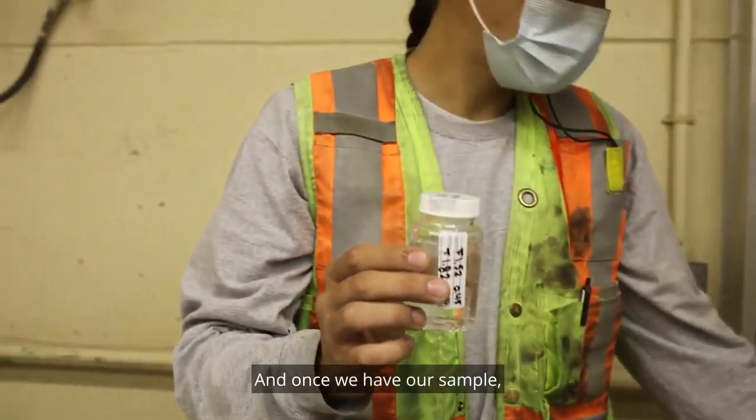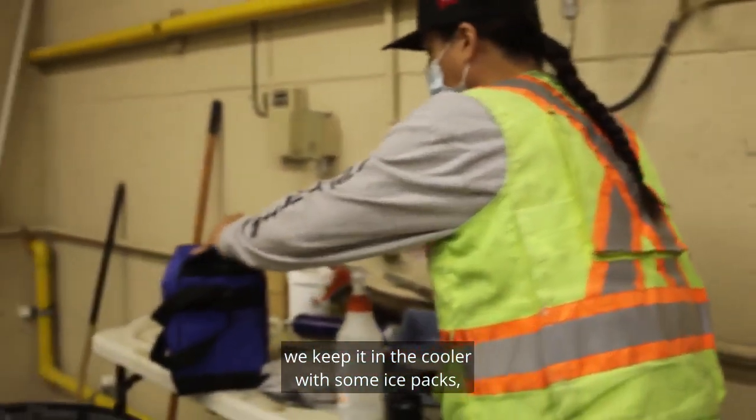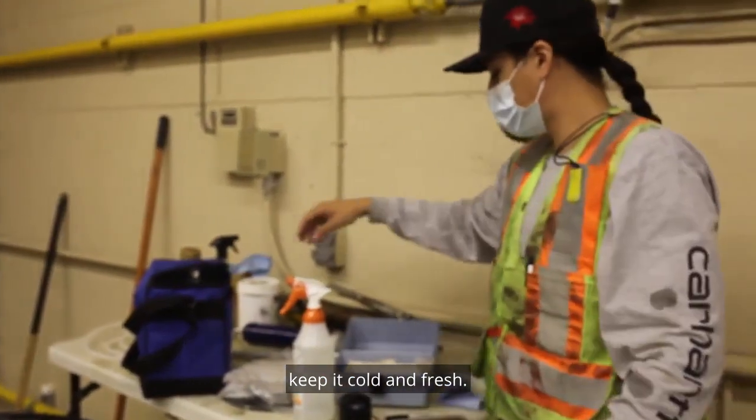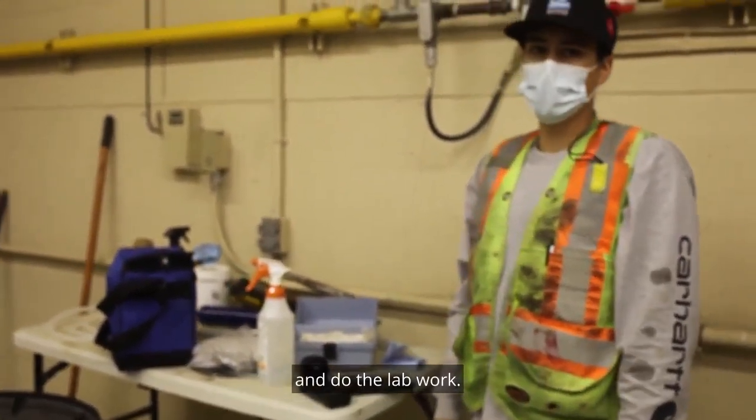Once we have our sample, we keep it in the cooler with some ice packs to keep it cold and fresh. Then later on we'll bring that over and do the lab work.